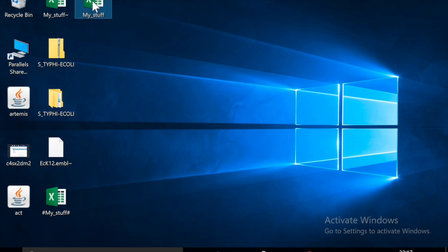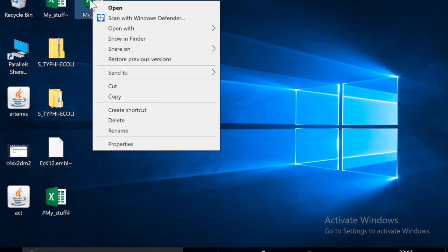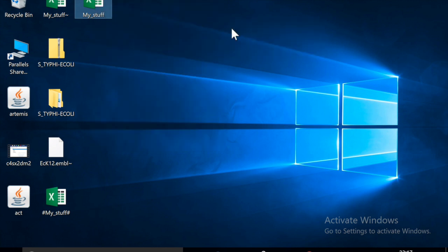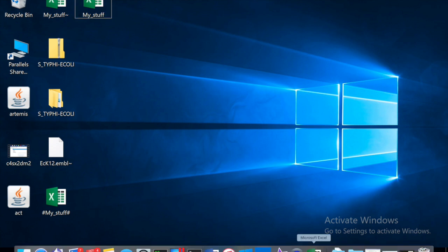So interestingly, it saved my stuff, the entry as an Excel file. I haven't got a clue whether or not that has worked and if it really is an Excel file, but it should be a tab delimited file in the current format that it's saved in. And of course that's been saved to the desktop here so that you can look at it.